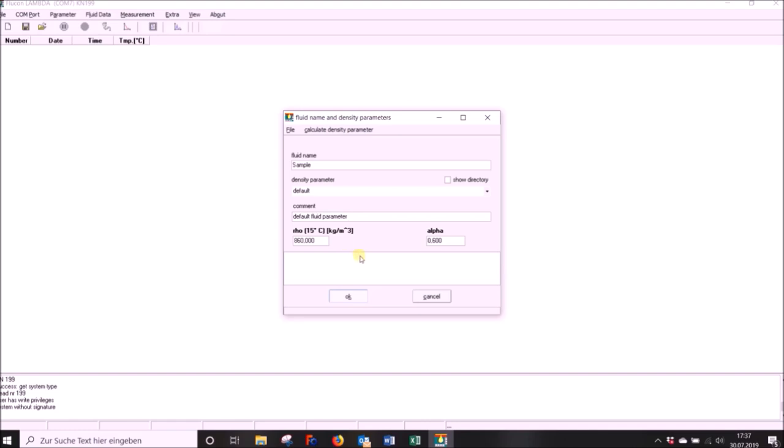If you are just looking into thermal conductivity measurement, simply use the default parameters here and proceed with the measurement by clicking on OK.